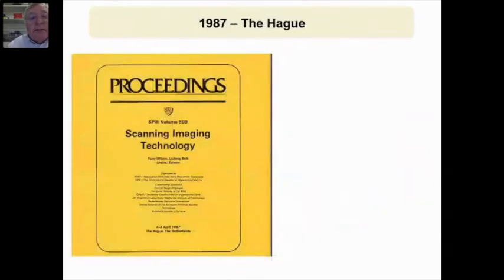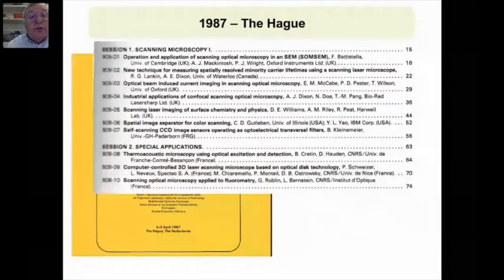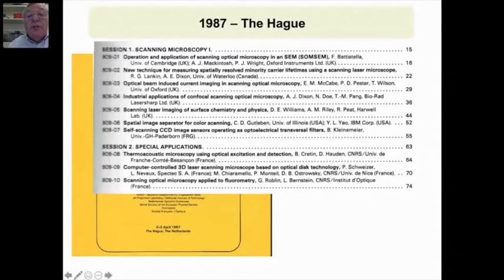Now, 1987, we had this scan imaging technology SPIE meeting in The Hague, and it was very much the start of understanding how these things worked. But most of the talks were industrial. One here, new technique for spatially resolved minority carrier lifetime, scanning laser imaging of surface chemistry, scanning optical microscopy applied to fluorometry.